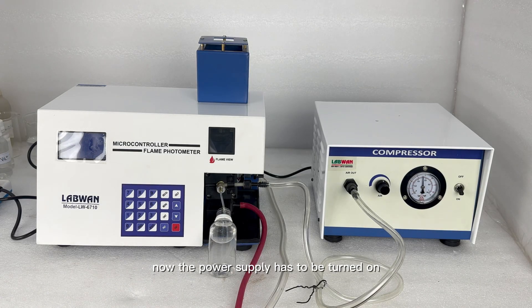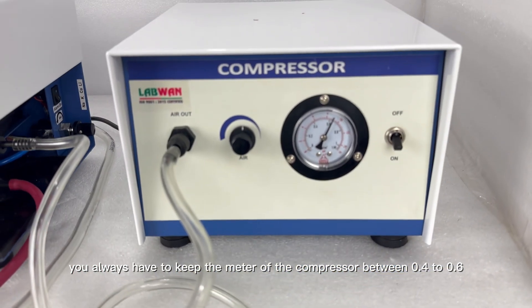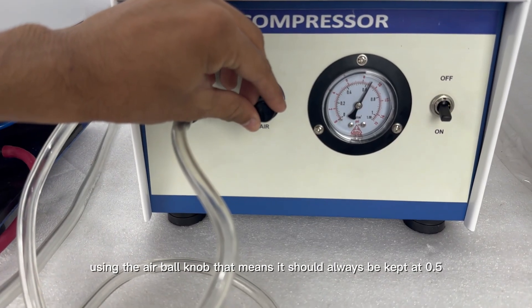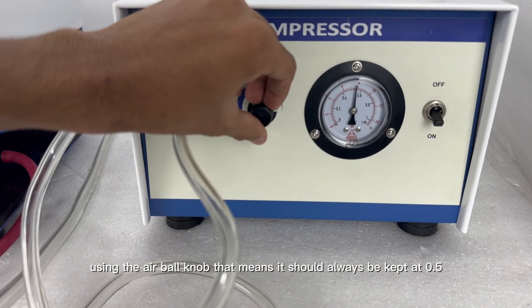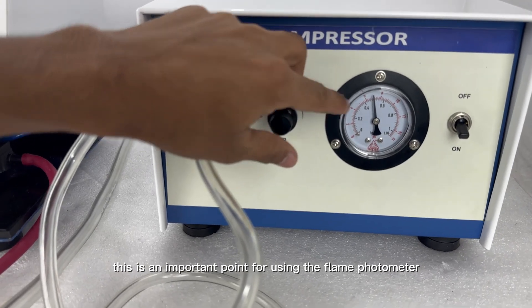Now the power supply has to be turned on and our compressor has been switched on. Now we will set the compressor — you always have to keep the meter of the compressor between 0.4 to 0.6 using the air ball knob, meaning it should always be kept at 0.5. This is an important point for using the flame photometer.